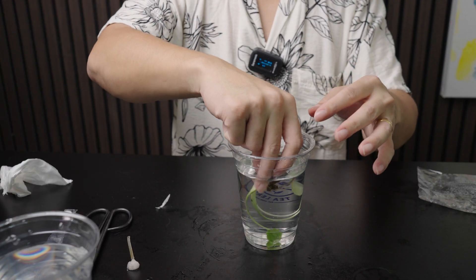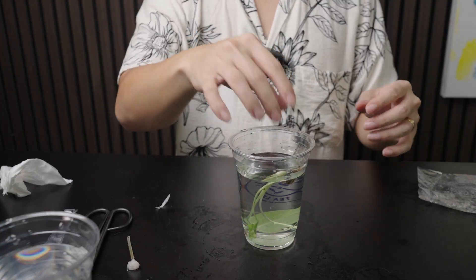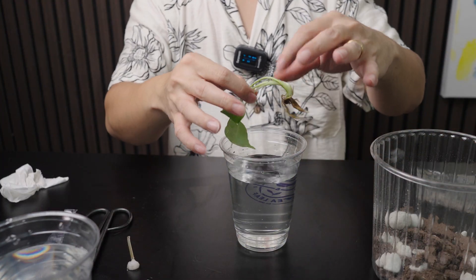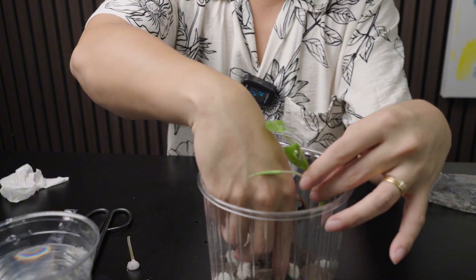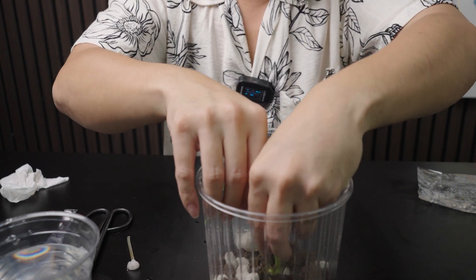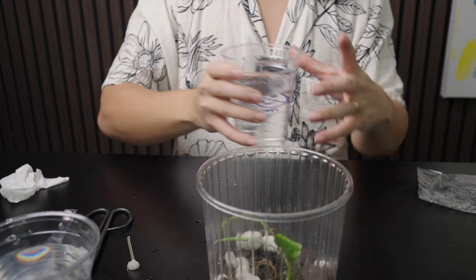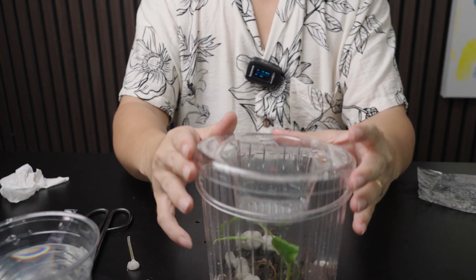Now the roots are no longer slimy, so I'm going to immerse the whole plant for a few minutes. I think we have given it the best chance to survive. We are going to put this inside the Grow Lid pot as well, and once again with the Grow Lid as a humidity dome.